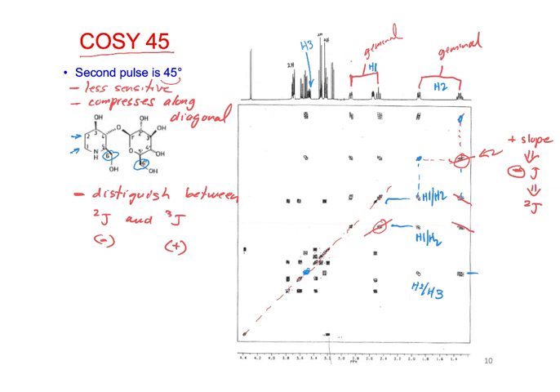So if we had this blown up on the screen and you could put cursors, we could probably walk our way through all of this tighter stuff too. Though notice that some of these are labeled as 2 protons here and 2 and 2, so some of those are overlapping. So it's a little tricky, but you might be able to walk your way through all of that.